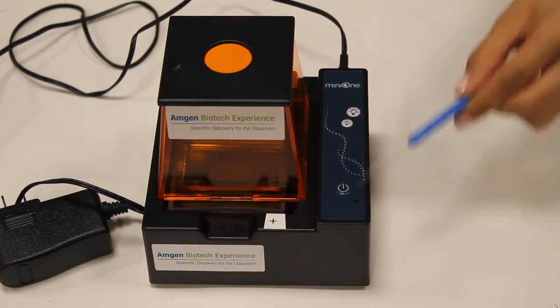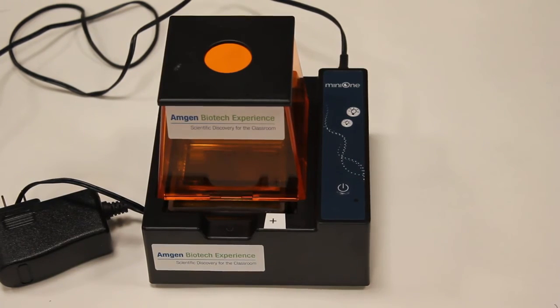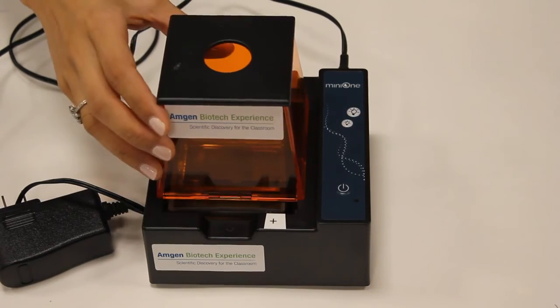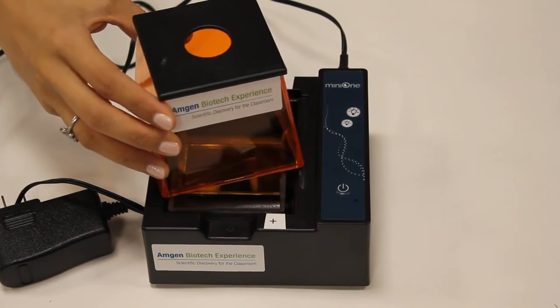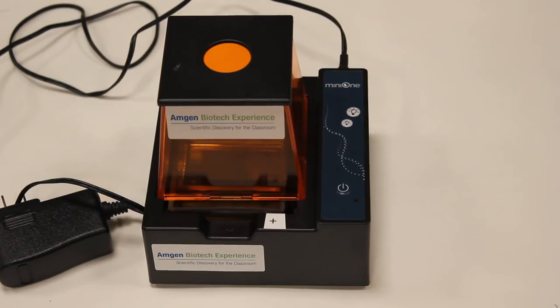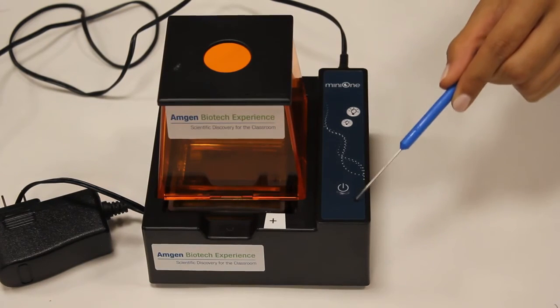The hood must be on in order to run the gel box. As soon as the hood is removed, the power will turn off. You will know that it is running when the green light is turned on the whole time.